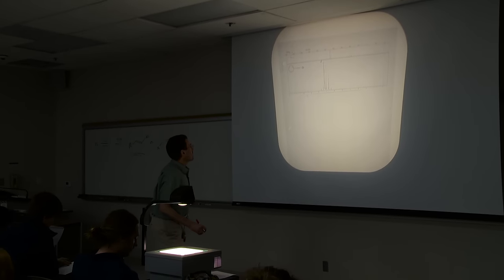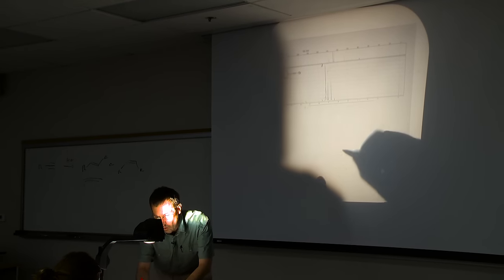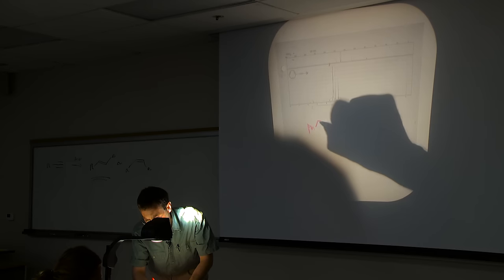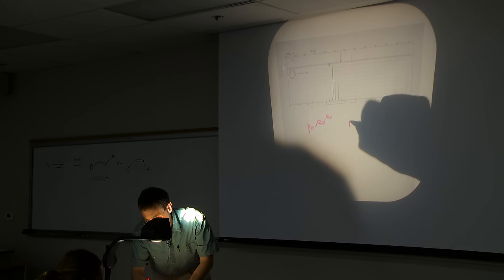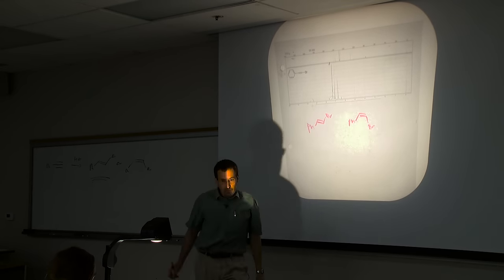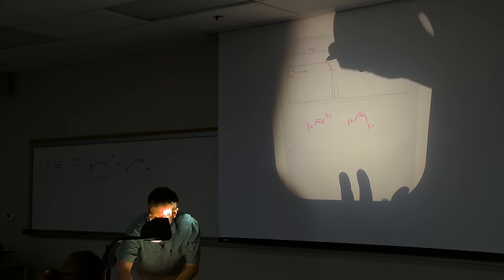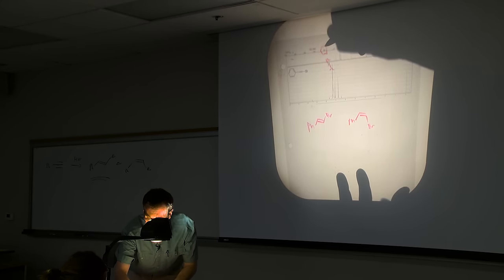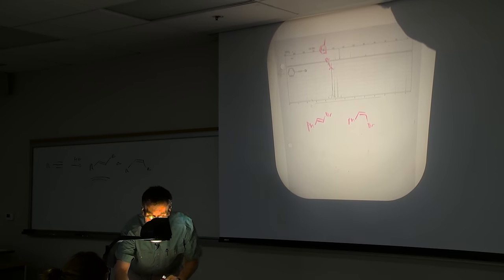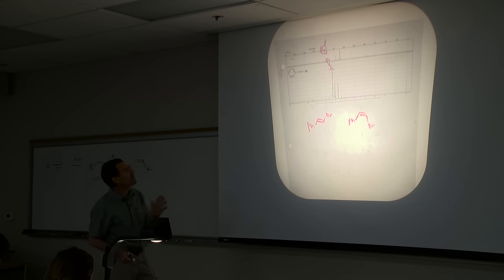And if you look at this spectrum, you start to see something. We've got two sets of peaks, right? The question is, do we have the trans or the cis? Now, phenyl, a benzene ring, benzene protons often are lumped together at about 7 parts per million. And so all of the phenyl protons are lumped over here at about 7 parts per million. I think there's one of the homework problems where they even talk about, don't even try to analyze a simple phenyl pattern.